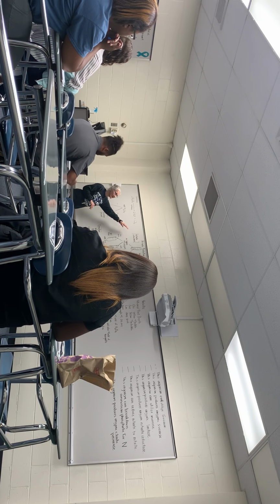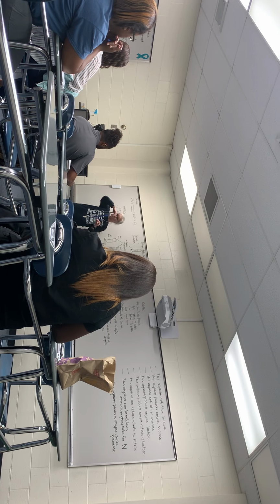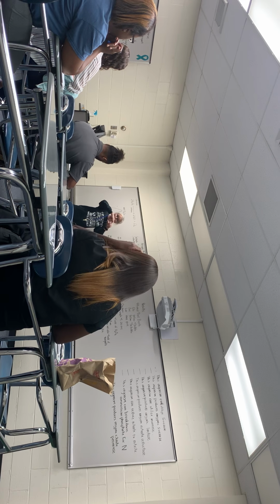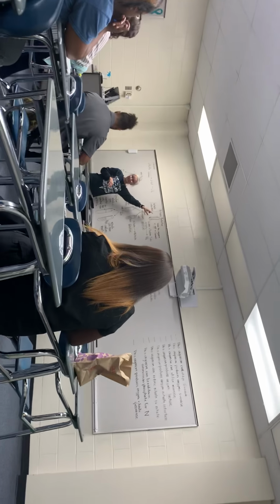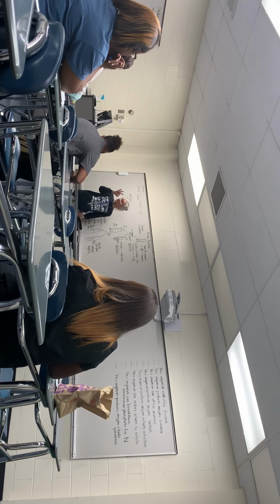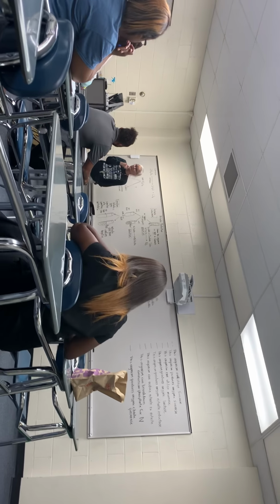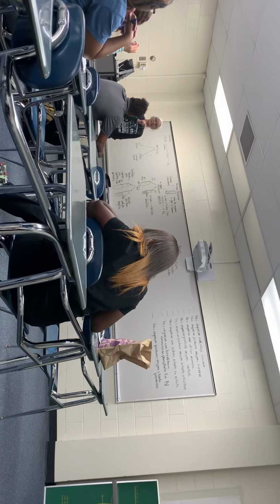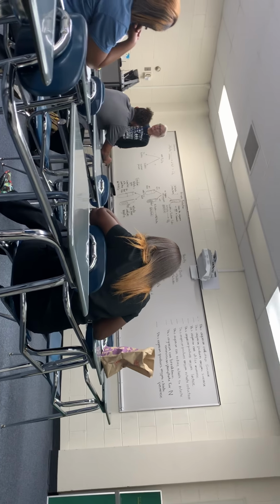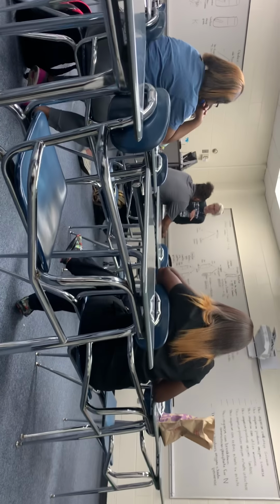Remember, in the nitrate test tube, okay, this also has a Durham's tube in there, right? So it's got the little upside down tube in there. So that's the first thing we look at is that Durham's tube to see if there's a bubble in there. Now the key to this one is you have to know that your organism is not a fermenter. If it's a fermenter, that bubble in the Durham's tube could be something other than nitrogen gas, okay?